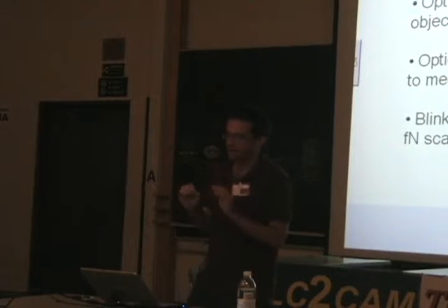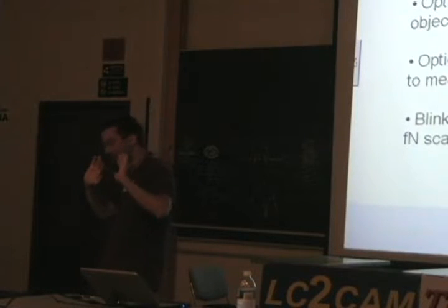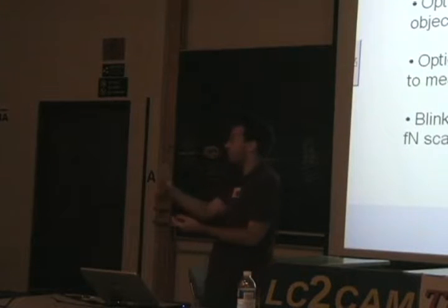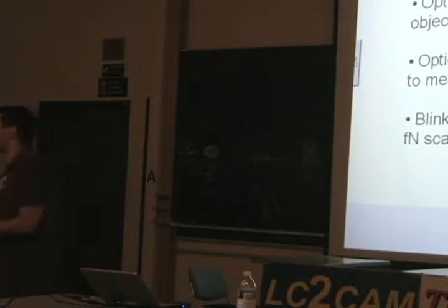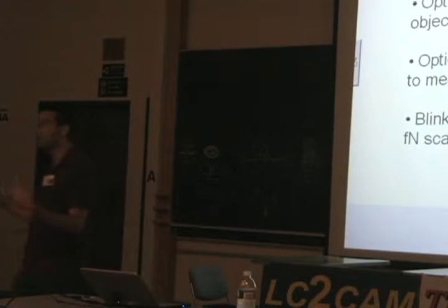And so we have a couple of different setups in our laboratory that are designed to get around certain issues. The key point is that there's a heck of a lot of laser light there, and if there's any absorption line, you're dumping a lot of energy in. So the best way to avoid heating is by choosing your wavelength very carefully. You can't trap everything in any wavelength. So for our systems in organic solvents, we use visible light. For biological systems, we use infrared light, and we do measurements as a function of laser power to make sure that we don't see differences as a function of laser power.